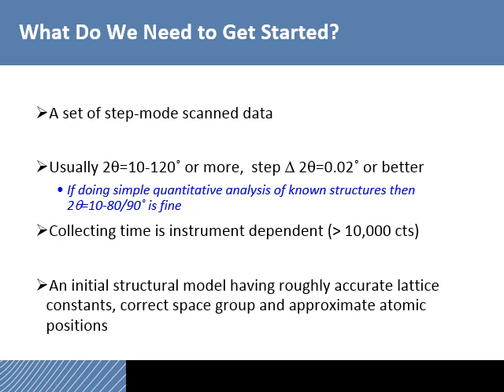If you have a complicated pattern, with many peaks and overlapping peaks, it's probably advisable to get the counts substantially higher than this. In most of the Rietveld refinements that I do in my lab, I would say that the strongest peaks are probably on the order of 60, 70, even 80,000 counts.